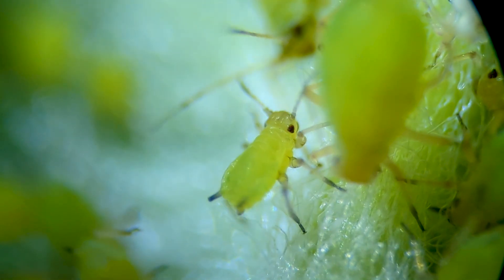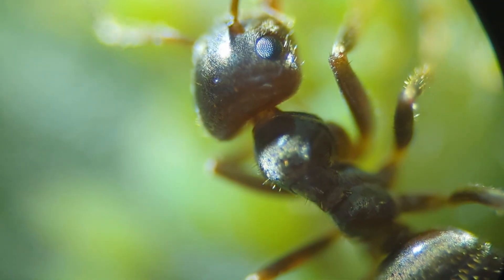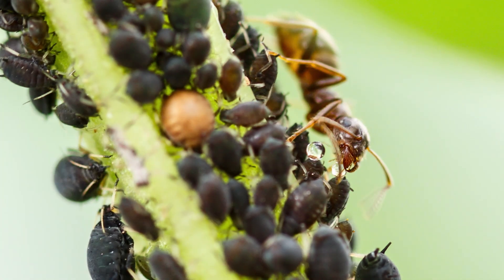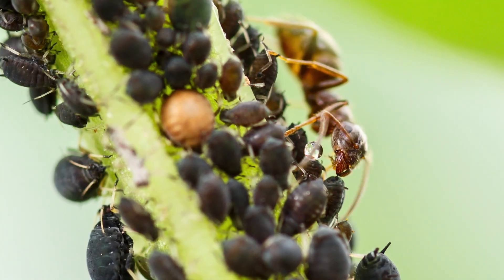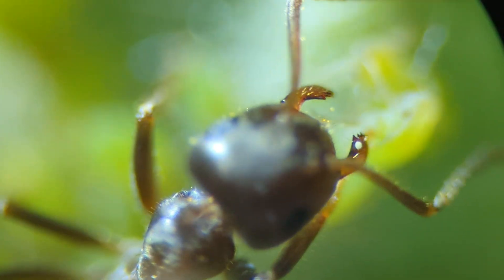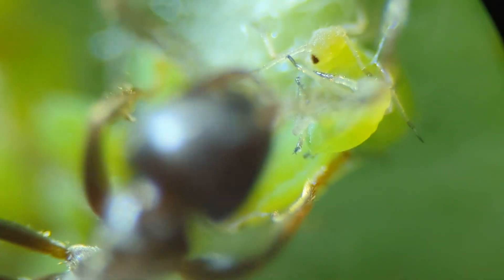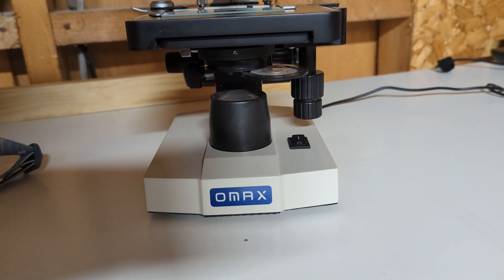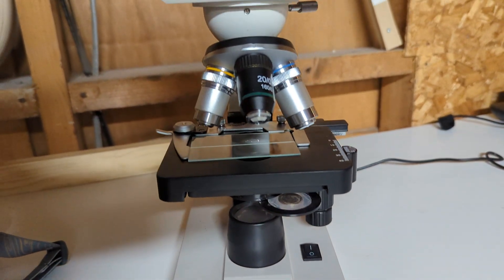I've been using my own microscope to take a lot of the really close-up footage. Some of the ants feeding off honeydew — that was actually stock footage, just because I wasn't patient enough to actually try and capture that. All the close-ups, especially of the green aphids, that's all me with my little microscope. I bought this thing several years ago.